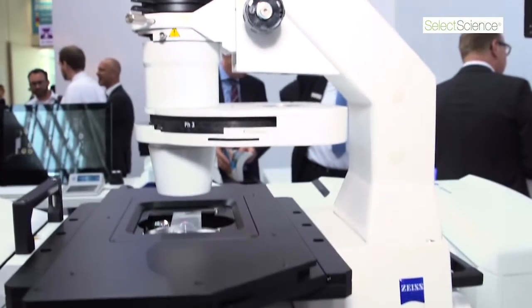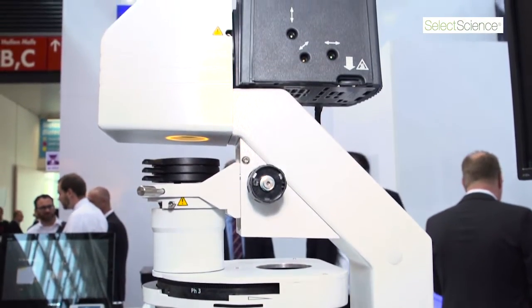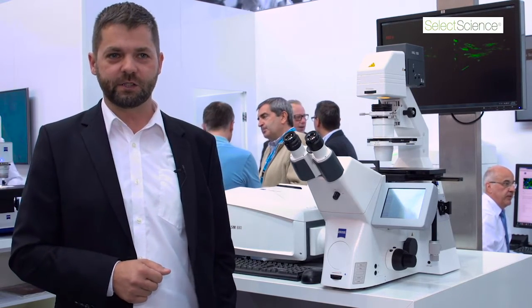The combination of fast imaging speeds and the confocal microscope opens an area of new possibilities that were, until now, not possible on standard confocal microscopes. We see applications especially in the fields of calcium imaging and imaging of any effects that are very transient.